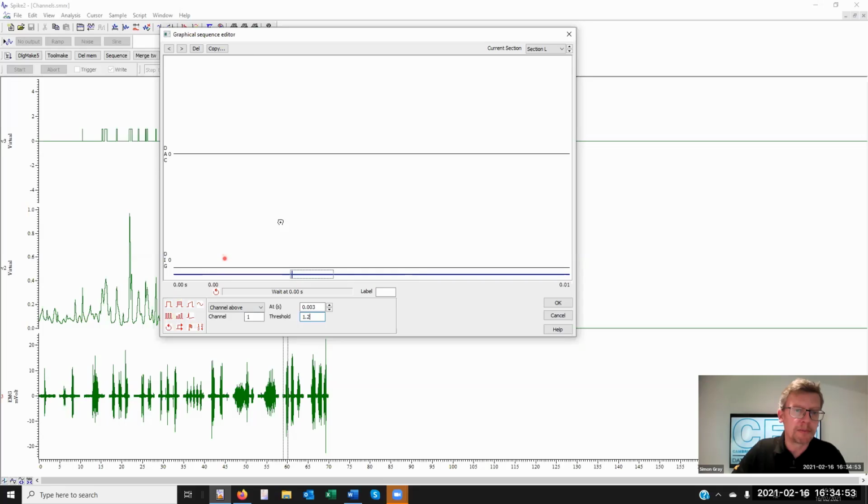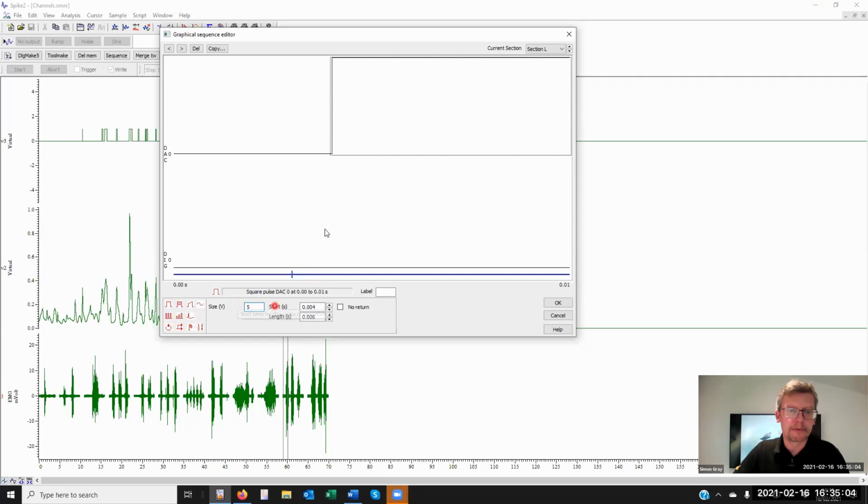We might then produce an analog or digital output. Let's just tick that one over there. Size of 5. Yep. Okay, so there's a rising edge trigger, which is this scale very soon after this decision point. So once the channel has gone above a level, then we can trigger the output. Okay, so that's how I would approach it.